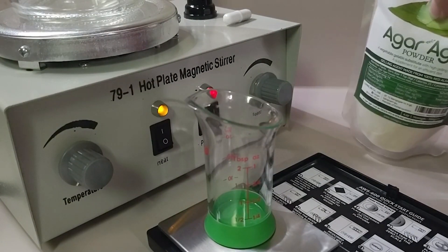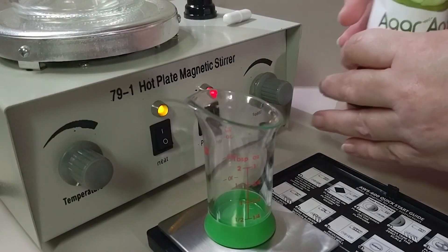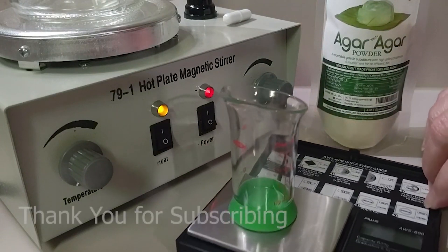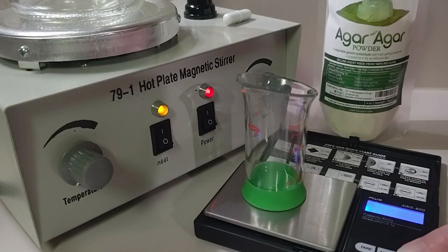Agar is derived directly from red kelp and is used as a vegan substitute for gelling and thickening various types of cuisine. It is also used as a thickening agent for the cultivation of molds, bacteria, and fungi in laboratories across the world, which makes it the perfect ingredient for home mycology exploration.